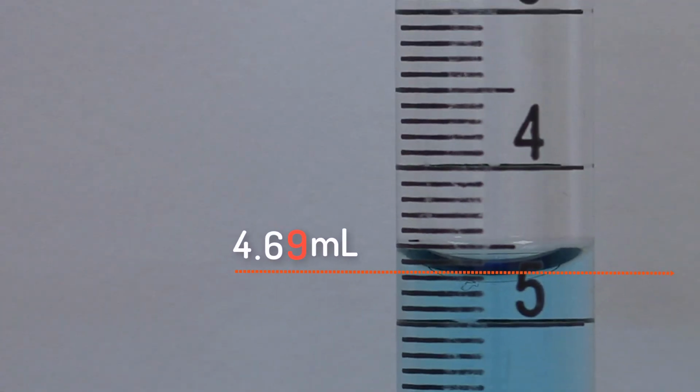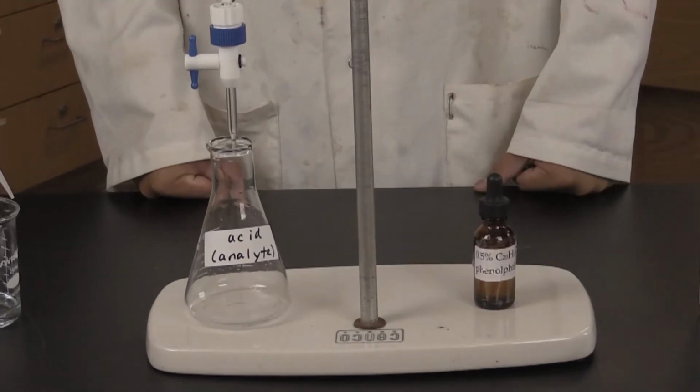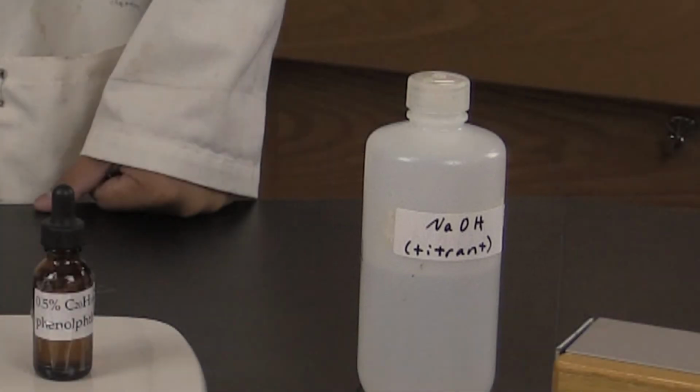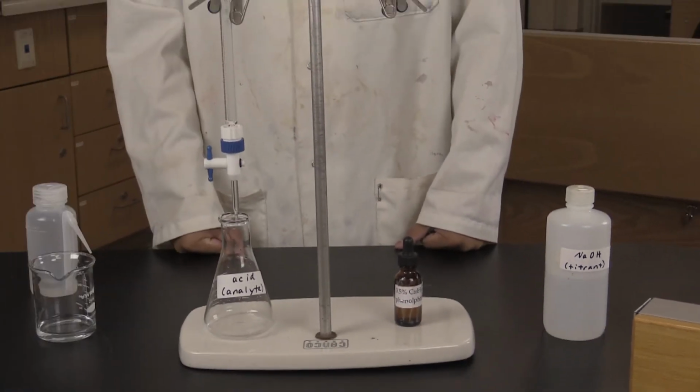Since the 9 is our estimated digit, it is called the doubtful digit, and our measurement is good to 3 significant figures and 2 decimal places. Let's do a simple acid-base titration, where we titrate a sample of hydrochloric acid with sodium hydroxide. The acid is our analyte, and the base is our titrant.